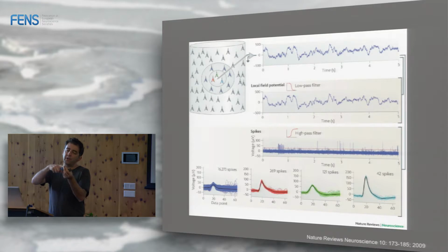So you come very close to the neuron. You nearly touch the neuron. You patch it, right? Then you get a very high spike from this neuron. And then you start to retract the electrode, and you see how far you can retract and still record from this neuron and still separate it from others. This is about 60 microns.